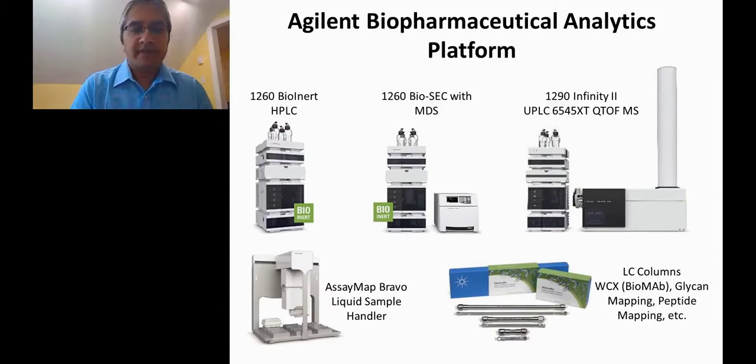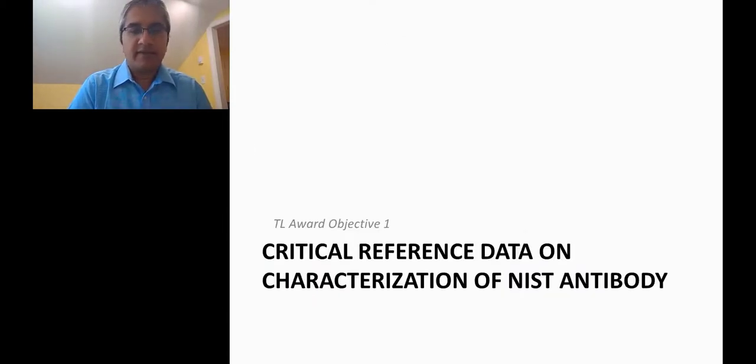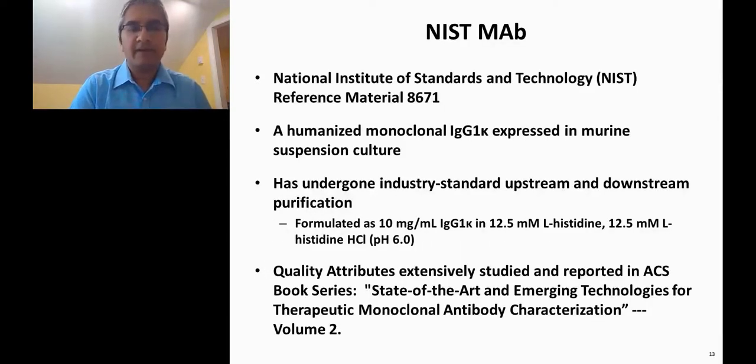The specific example we chose for characterization using these tools is the NIST antibody. The NIST antibody is supplied by the National Institute of Standards and Technology.